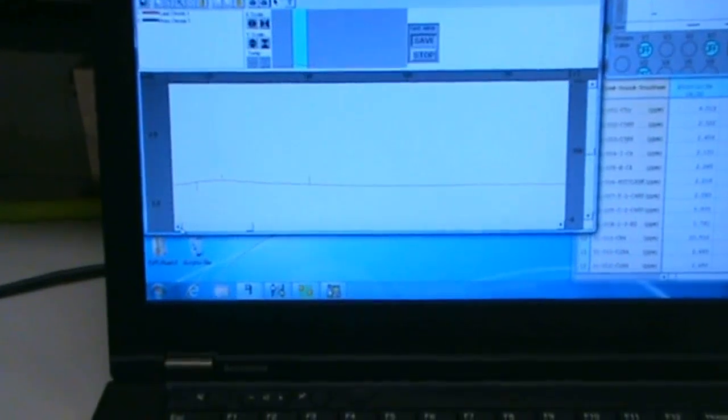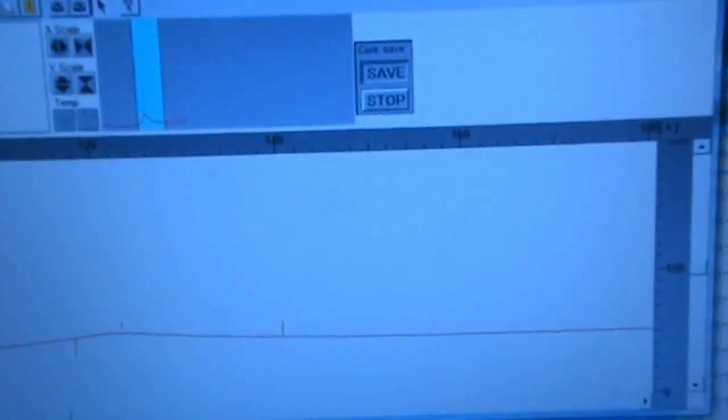There's magic right there. Okay, so you're seeing that. All right, so now let's hit this little guy, and what's happening? We're shrinking that. Let's make it back about that size, and then we got to go over here to this, and we're going to bring it down. And once we bring it down, now we are zoomed in like crazy on this peak.